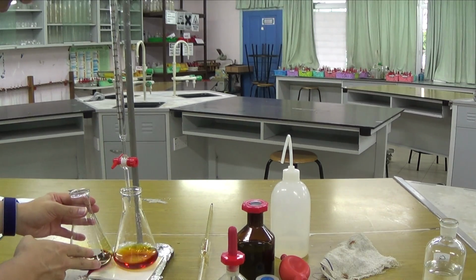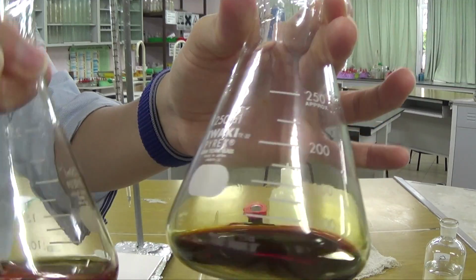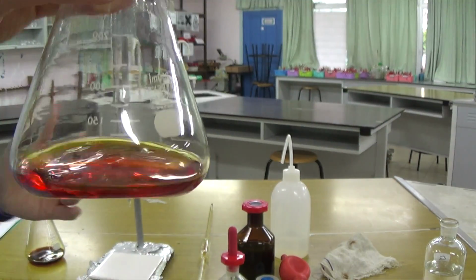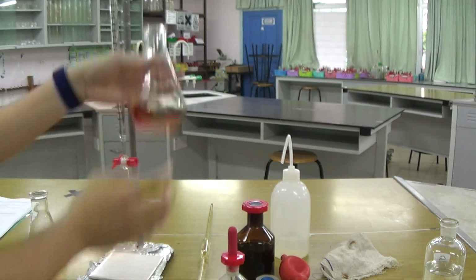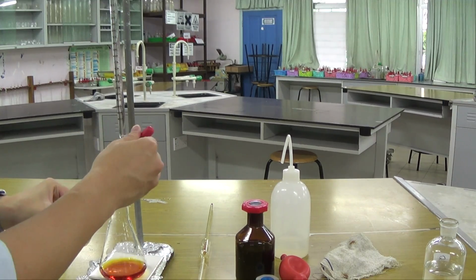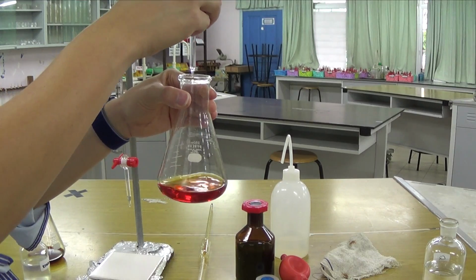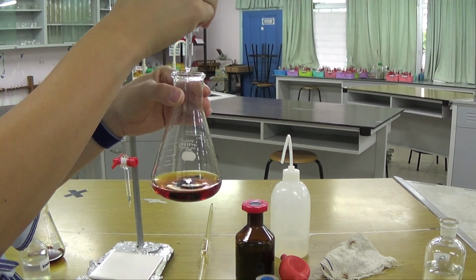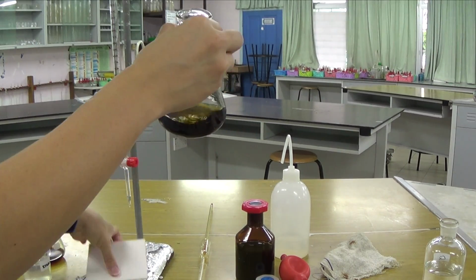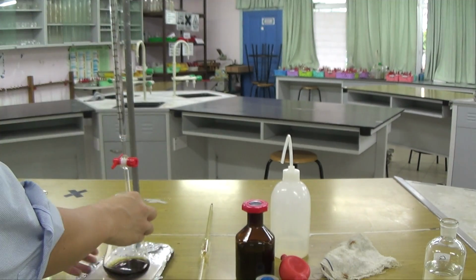So this was the original solution, a lot darker. This is just the iodine on its own. This is the one where I've added a bit of thiosulfate already, so some of the iodine has gone to iodide. I would say this is about the region that I would add in the starch. It depends on you really, but the moment I add in the starch, you should hopefully see it get blue-black. You don't need to add a lot of starch, because just a little bit of starch will give you the blue-black coloration. So it's kind of like dark coloration. Of course, the more you add, the darker it becomes.